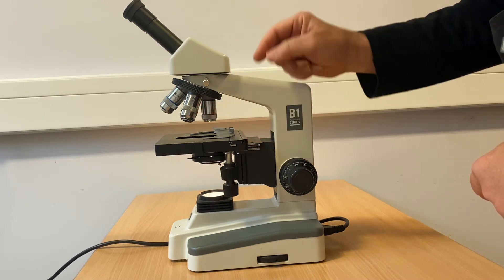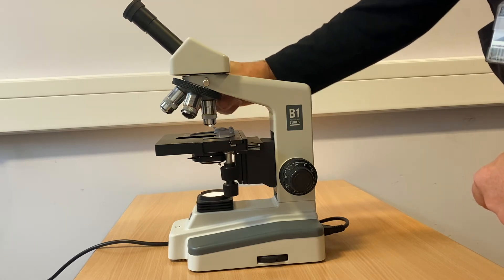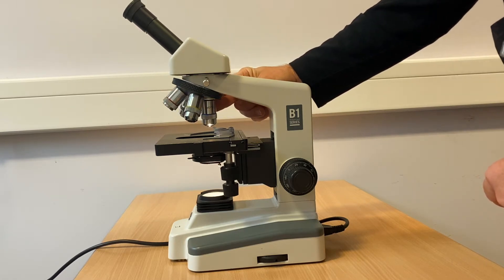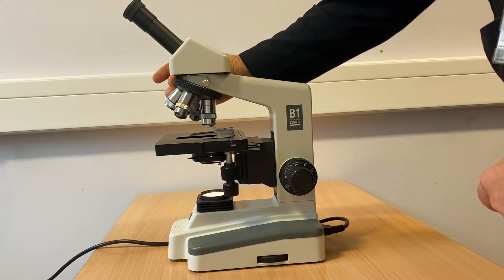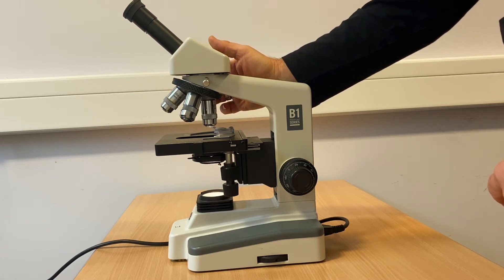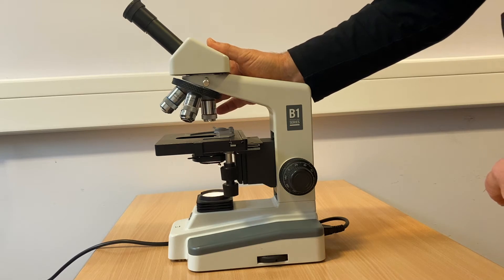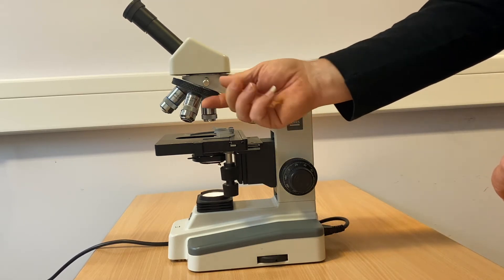The amount of magnification is controlled by the choice of objective. There are four objectives on this microscope. The red objective is a 4x magnification, the yellow is 10x, the blue is 40x, and the white objective is 100x and is used in oil immersion. Coupled with the 10x magnification of the eyepiece, this will give the total magnification value.